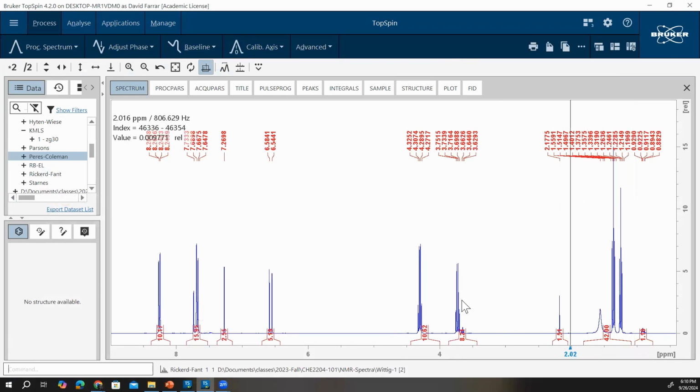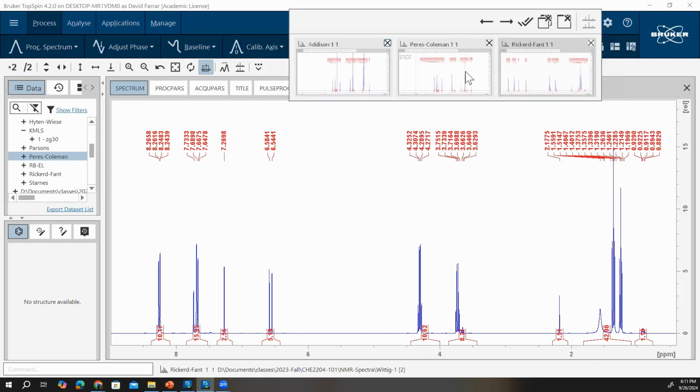This is another example of the two quartets. In this case, the solvent is smaller than the sample, and our integrations aren't normalized. In fact, this one hasn't been properly processed. You can see this was done automatically, and the computer integrated this OH peak and both triplets together. You will need to process your spectra when you download that. Delete the old spectra and integrate the new ones. Let me jump real quick over to, yes, this is one that's clean.